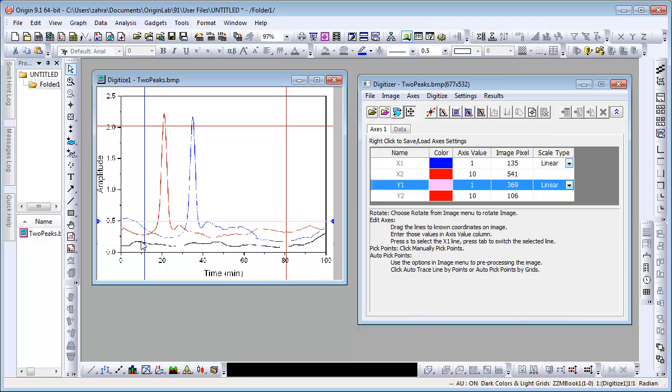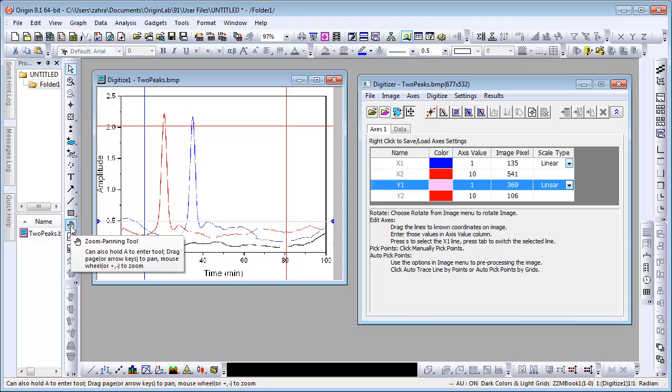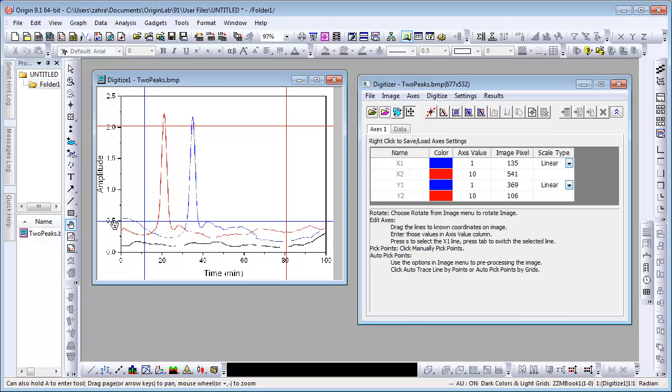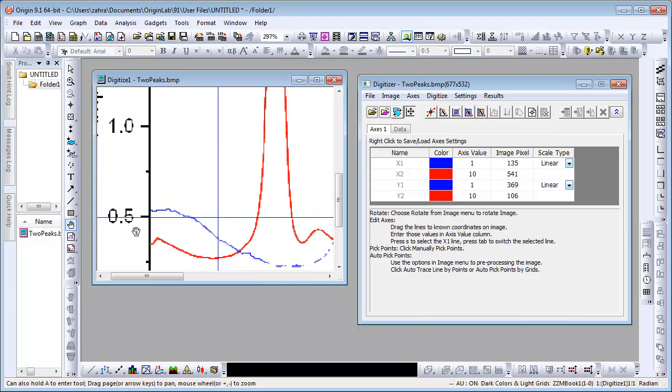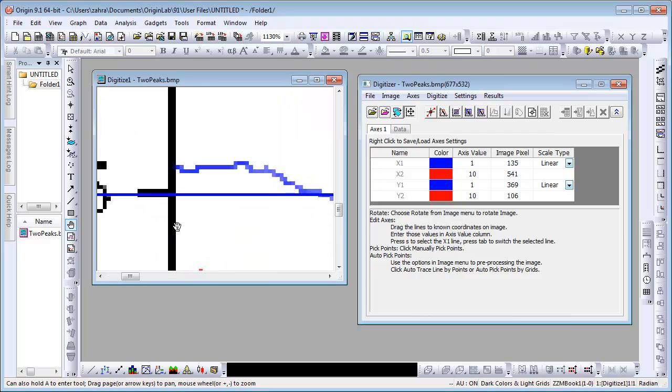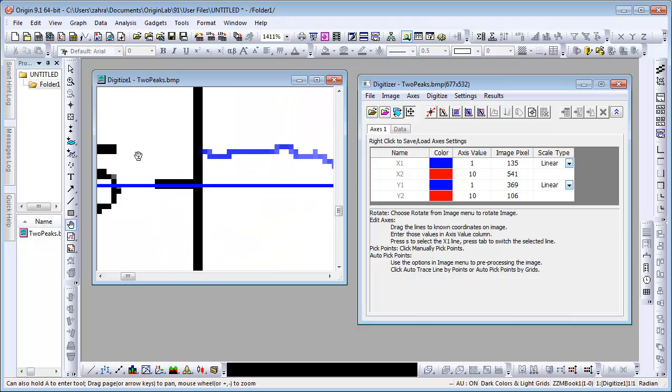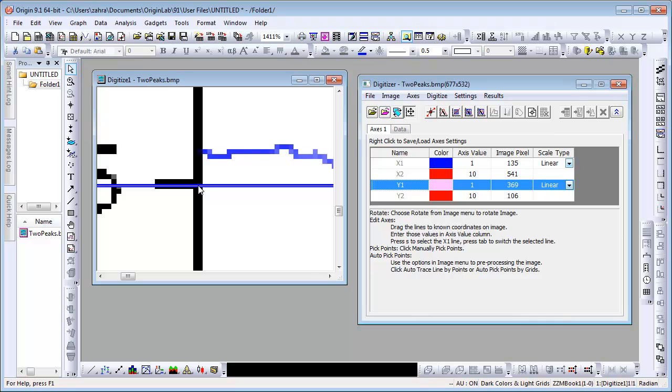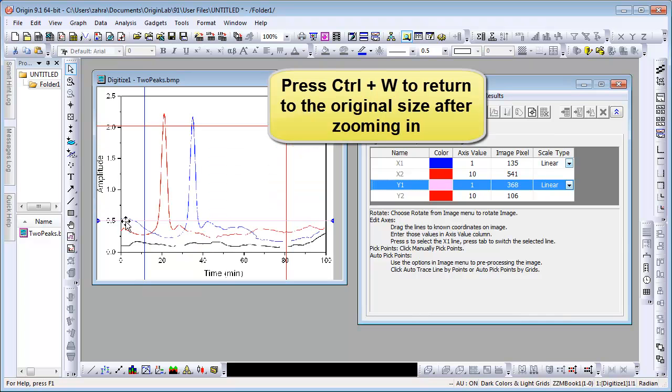For greater precision in aligning the axes, we use the Zoom and Pan tool here. Zoom into the image. Click the Pointer button to exit the Zoom mode and align the axes. Use Ctrl-W to exit to the original size.